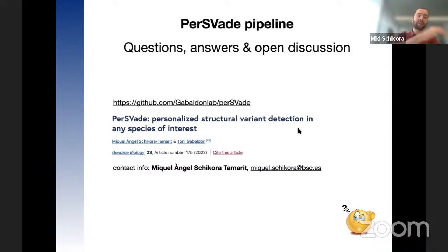And this was not the case for other species. I think this shows that of course there are some limitations with much lower coverage. You cannot have very accurate detection. So there's more diversity in this, and that's what explains it.